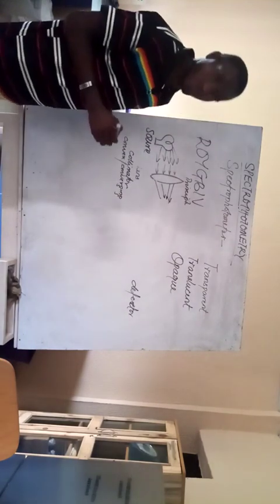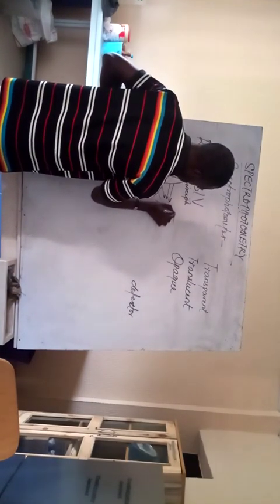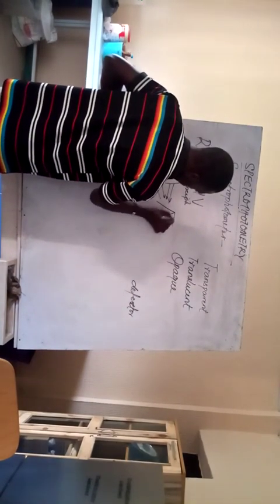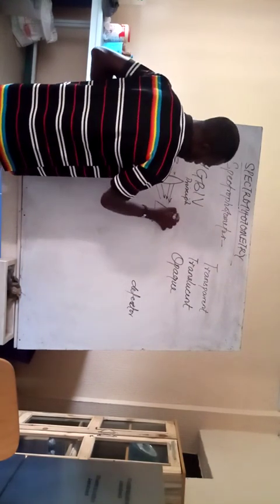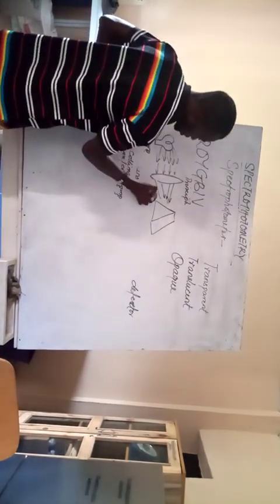And what does it converge it on? It converges it on a glass prism. So you basically have something like this. Because it's a prism, you have something like this. Alright, so it focuses the light on this glass prism.